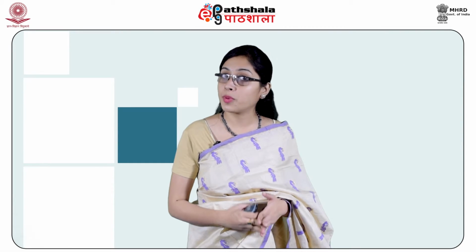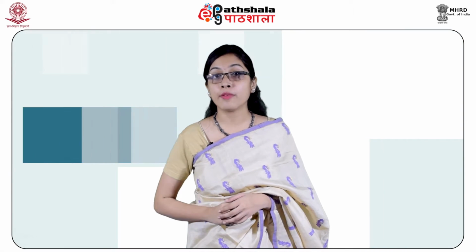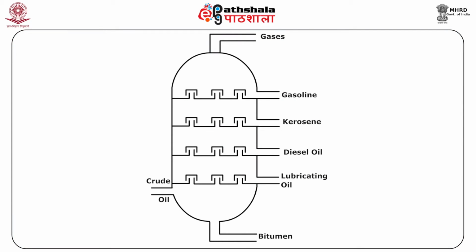The solute then moves down the column with equilibrated mobile phase in a stepwise manner from one plate to the next. The concept of theoretical plate in chromatographic column was given by A. J. P. Martin and R. L. M. Synge, for which they were awarded the Nobel Prize in Chemistry in the year 1952. Here the figure shows a separating column for separation of various components.